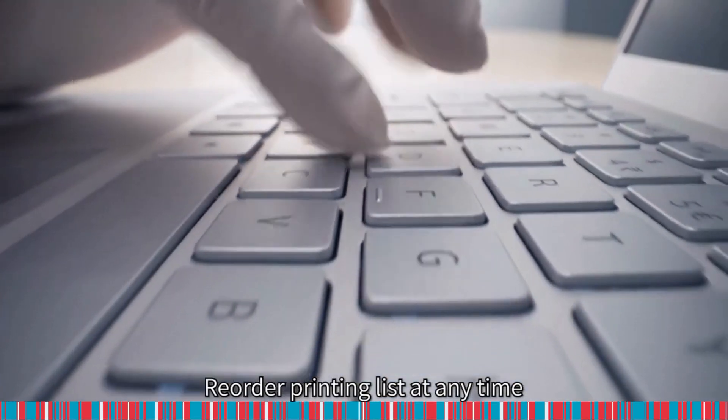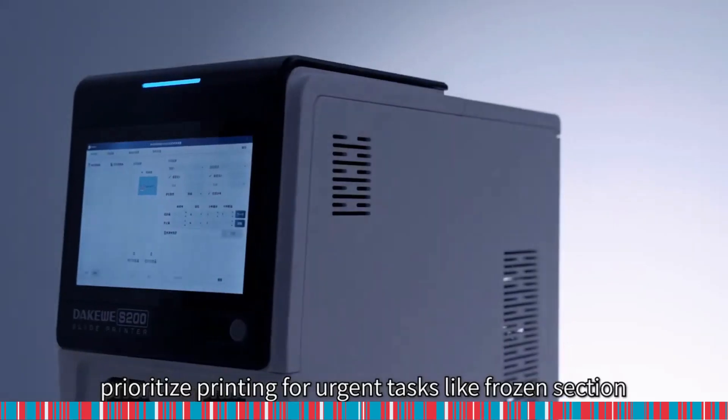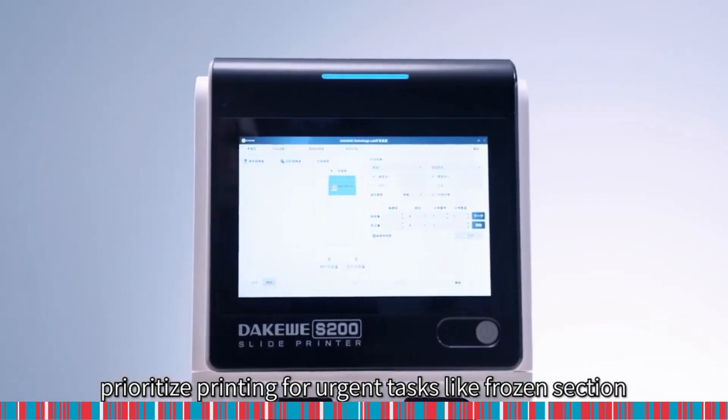Reorder the printing list at any time. Prioritize printing for urgent tasks like frozen section.